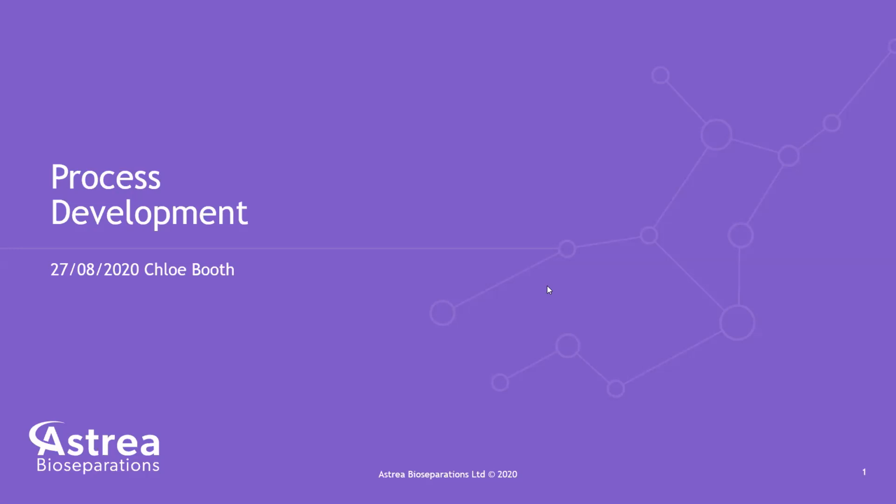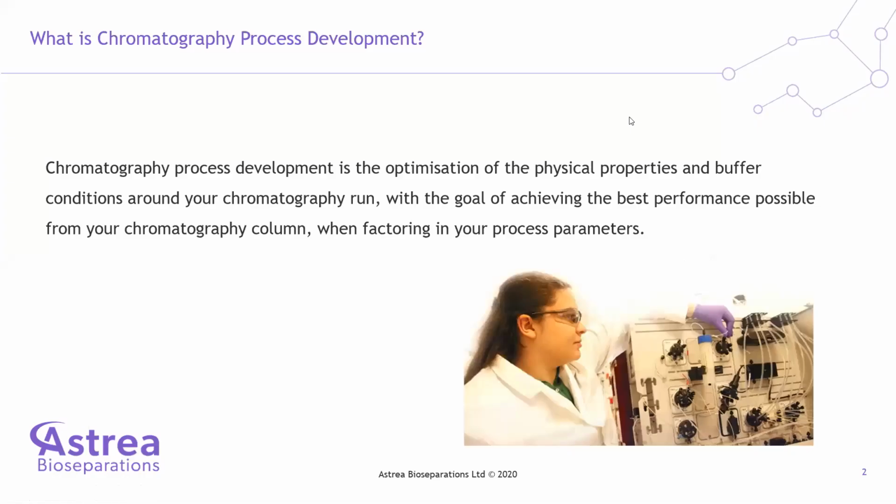Okay, thank you, Andy. So my name's Chloe Booth, and today I'd like to talk to you about chromatography process development. So the first question is what is chromatography process development? This is where we look at optimizing the physical properties such as flow rates and column dimensions and the buffer conditions around your chromatography column run. The goal of this is to achieve the best possible performance for the chromatography column run when factoring in your individual process parameters.